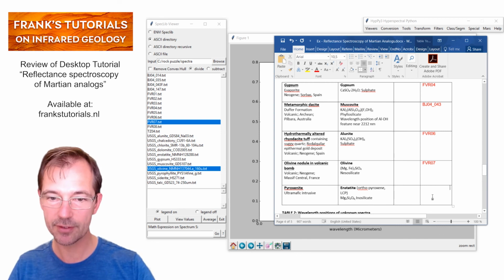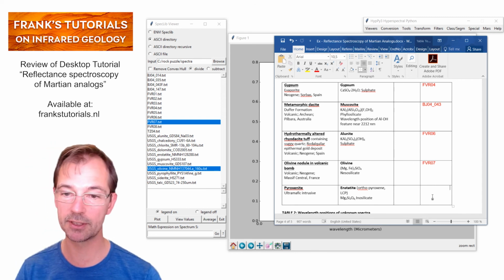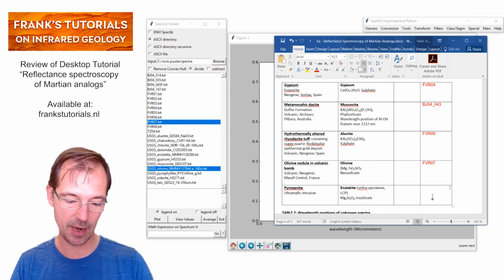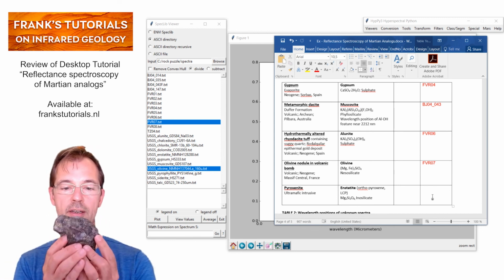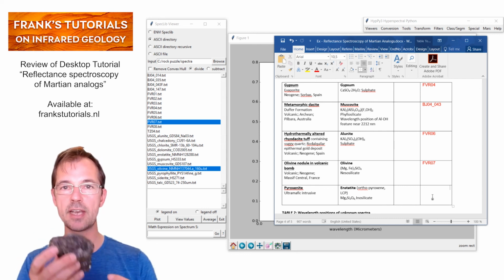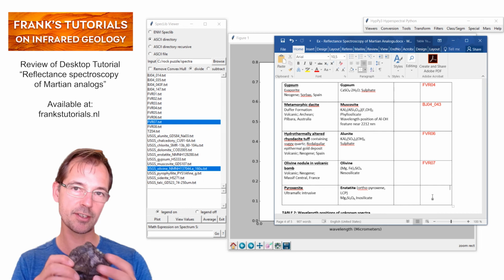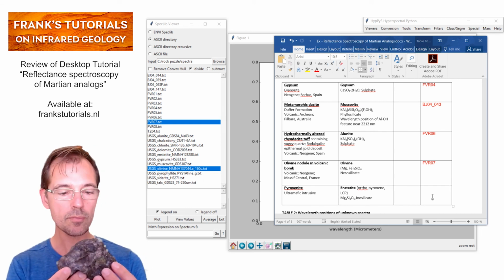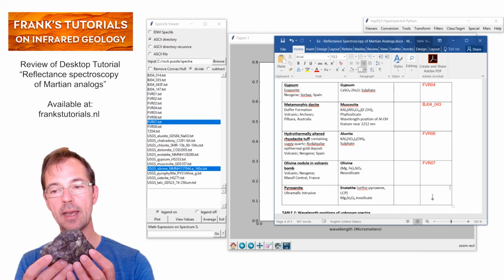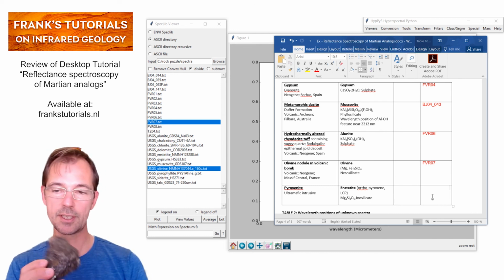Then there's one left, which is the pyroxenite, which contains the low calcium pyroxene enstatite. And there's also one rock specimen left, which is FVR08, which is this. It's a dark rock with large crystals that are intergrown. It's heavy, it's a dense rock. So at least the texture is an indication for an igneous rock, and the density is an indication of a pyroxene rich rock.